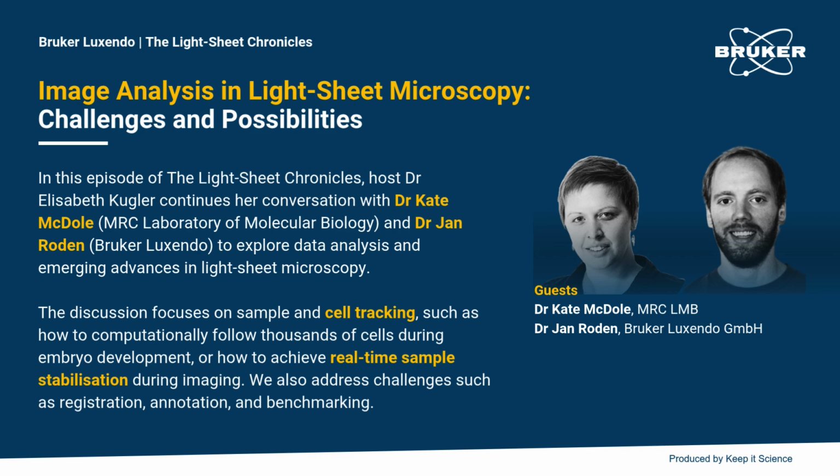Yeah. So we primarily use cell tracking, and again, some of it depends on the particular biological question. But for the mouse embryo, our goal in being able to track every cell in the embryo is to not only know, okay, this cell came out of the primitive streak here and ended up being a neuron. This cell came out and ended up being a cardiac cell, is to be able to actually trace lineages. So knowing where this cell divided and gave birth to these progeny, which gave birth to these progeny, and where did they end up? So do you have cell fate switches or cell fate bottlenecks? Where do lineages start to diverge? How similar are clones to each other?